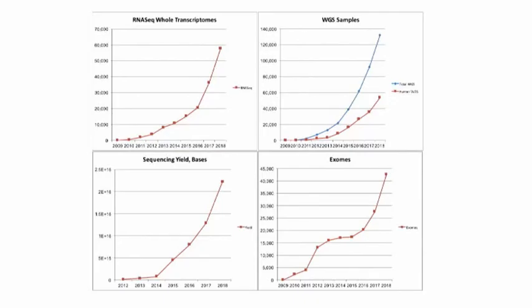So probably like many places, as sequencing capabilities have gone up, so has the variety of both yield and numbers of samples that have been enabled as the costs have gone down. This is just a vignette from our lab through 2018 in terms of numbers of both yield and bases, and then transcriptomes, whole genome, and exomes as far as amounts.